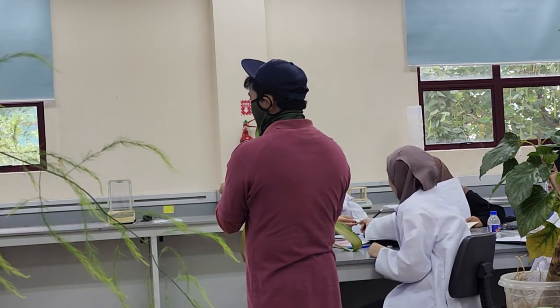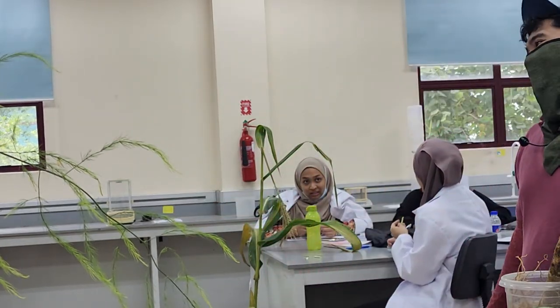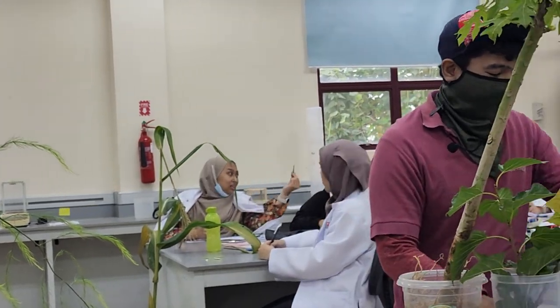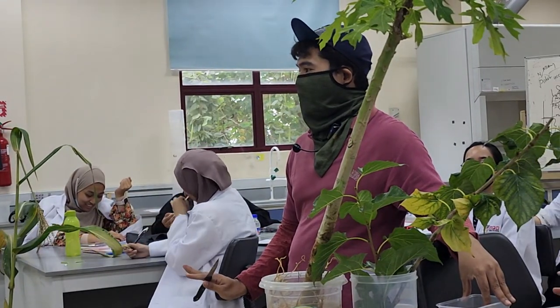And all the way to the center. Habis. Can you do it with mulberry? No. Because this is the true stem. That's why. Okay. All right. Okay. I think that's all. Any question? All good? Okay.